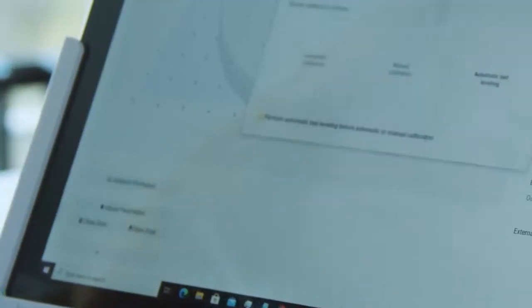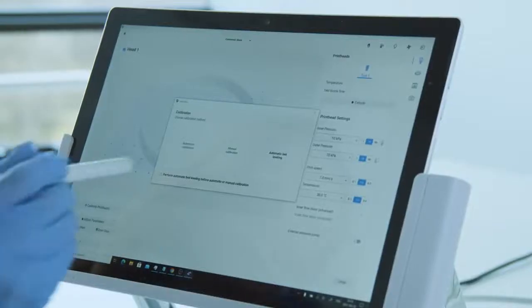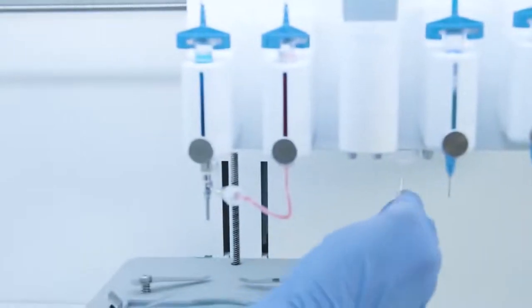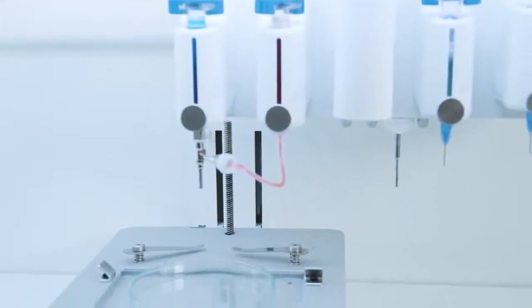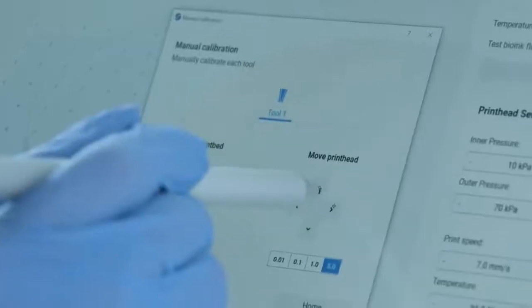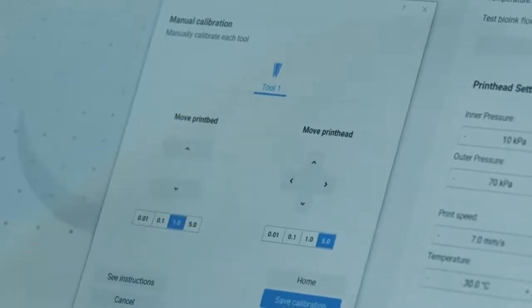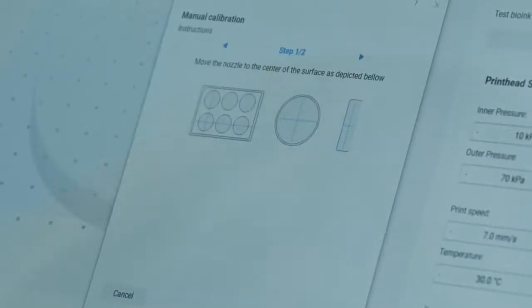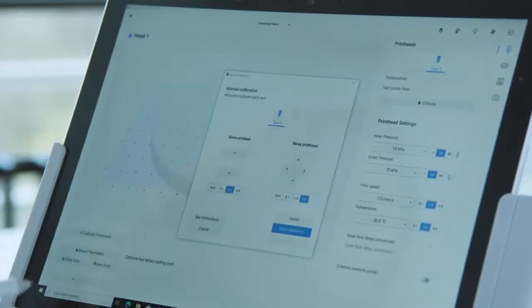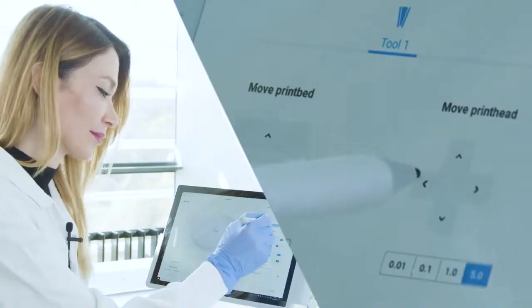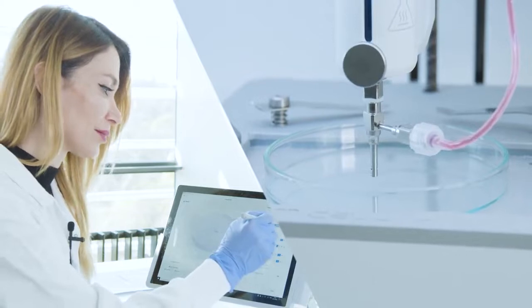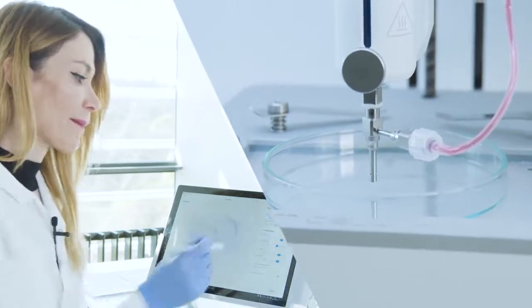Press this tab to calibrate the print bed and printheads. Press the auto bed leveling, adjust the probe here, and ready. Then for the coaxial nozzle you should go through manual calibration. You can find the instruction for calibration of different types of plates and petri dishes here. Select the spot in the center of the petri dish and make sure that the nozzle is touching the surface.